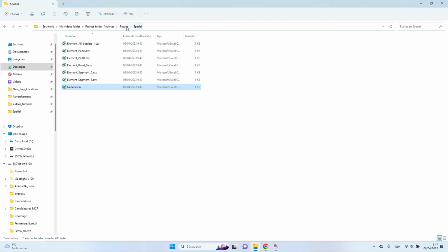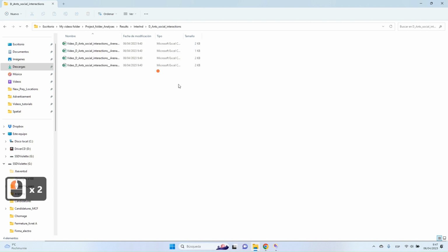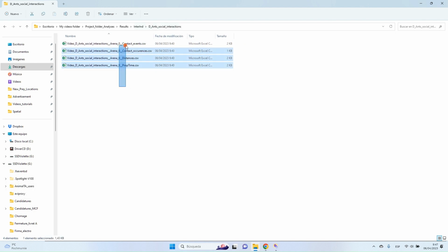That's all for the spatial information. We also have the inter-individual information. Once again, in this folder, you will have only information about videos that have more than one individual per arena. Let's go to the end, because it's the one we used for the social interaction information. And you have four different files.